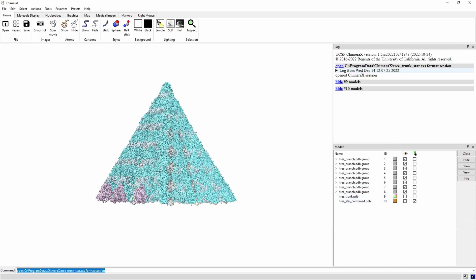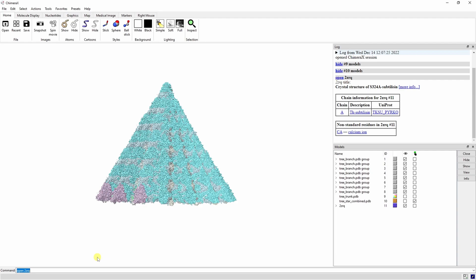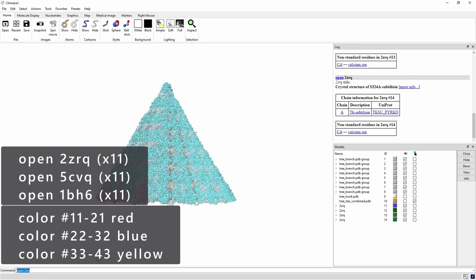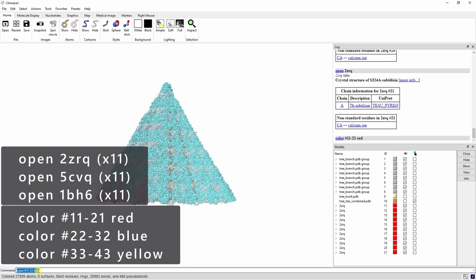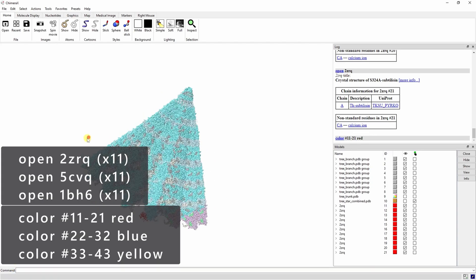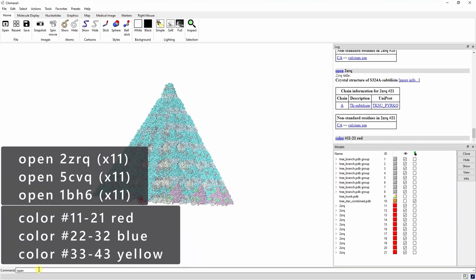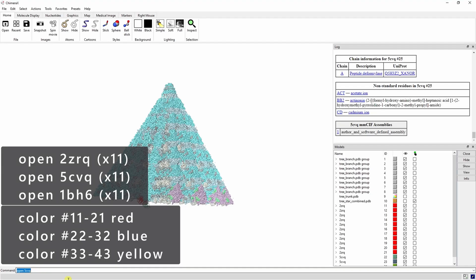Now let's open up some small spherical proteins to make the light strings. Open up 11 2ZRQs, 11 5CVQs, and 11 1BH6s. It helps to color them to keep track.